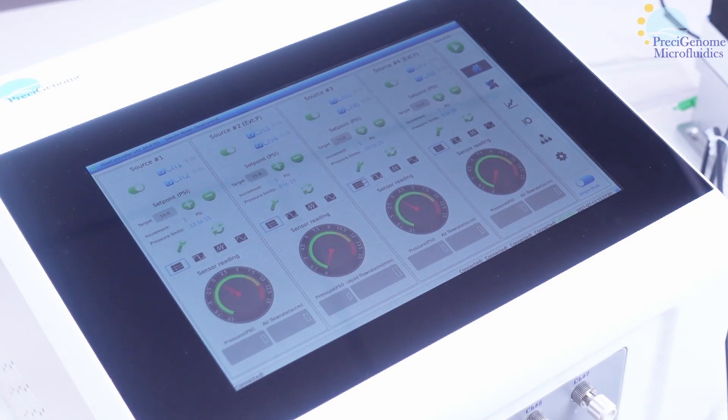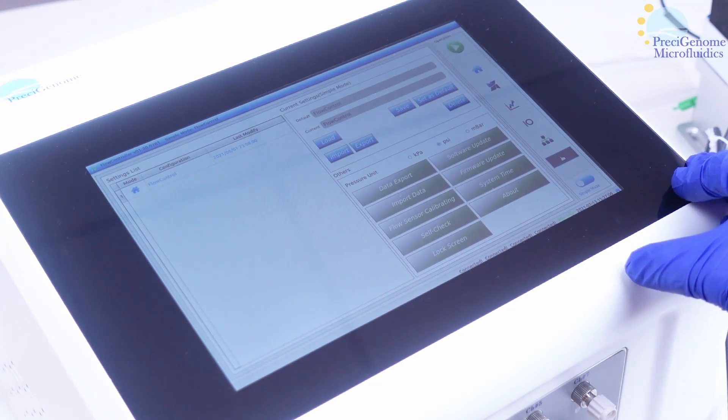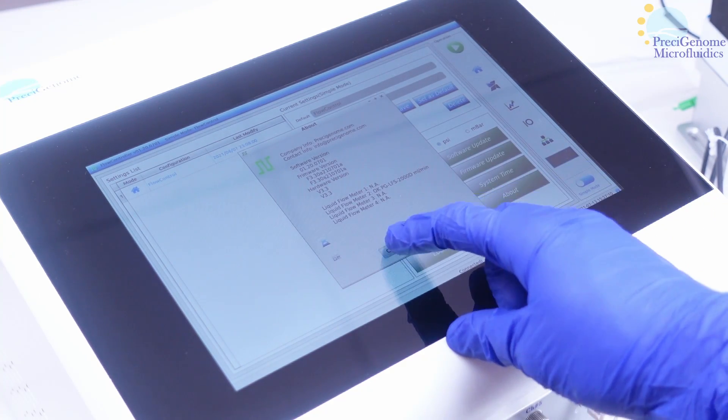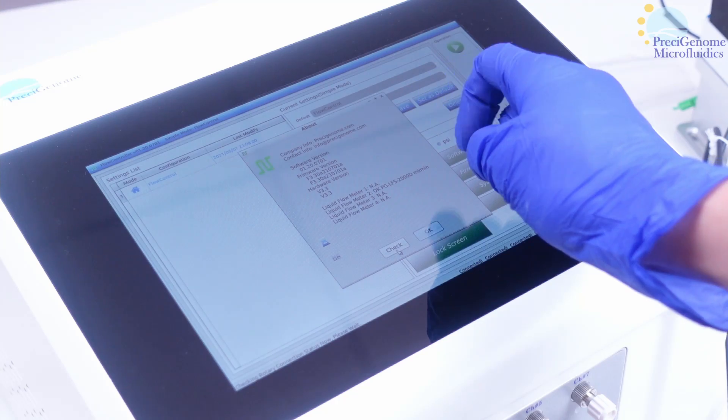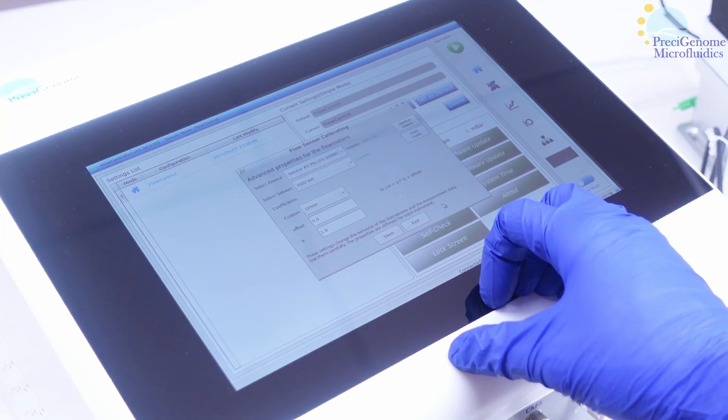After the flow sensor is connected, we'll still want to check that it was recognized. In the pressure controller home screen, go to General Settings, About, and Check. Your flow sensor model should be displayed on the appropriate channel. You may then proceed to calibrating your device.